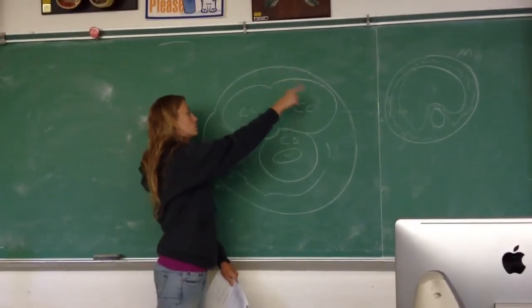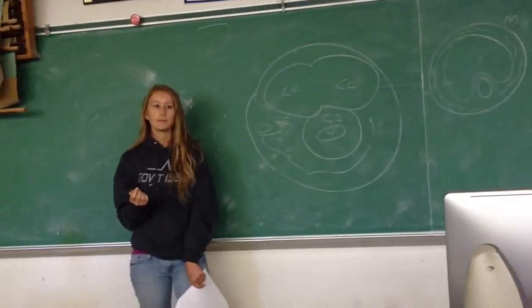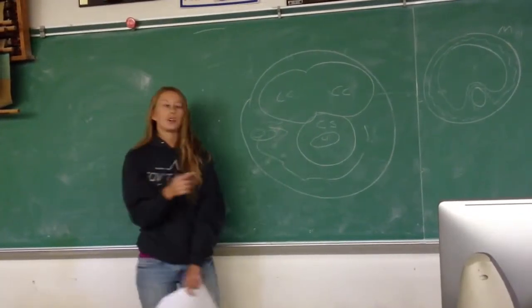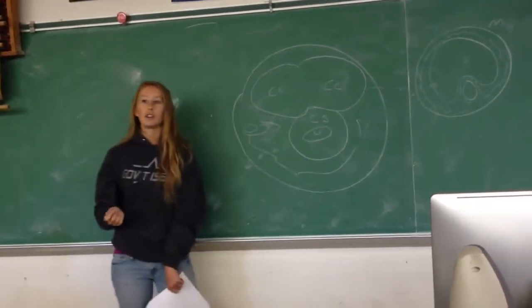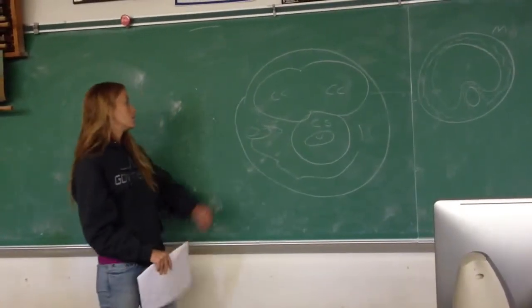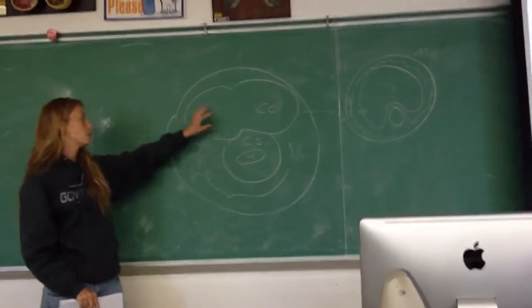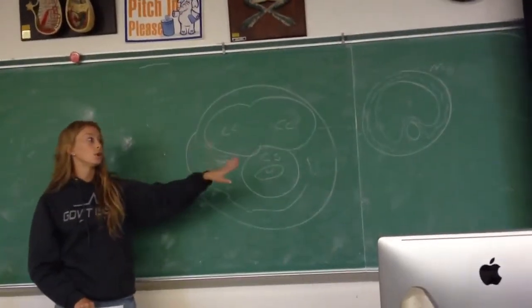These two circles that you see up top, they're both called the corpus cavernosum. And then the bottom circle of muscle is the corpus spongiosum. And in the middle of the corpus spongiosum, you'll see a hole with a lumen in it. That's the urethra. And as you can see, this entire face structure is going to be in a larger circle, and there's going to be other tissue around that. But these are the three, or I guess four structures that you would need to be paying attention to when you look at the slide.